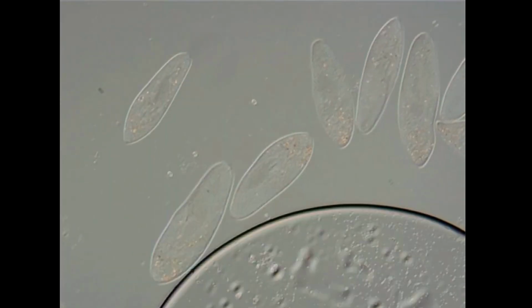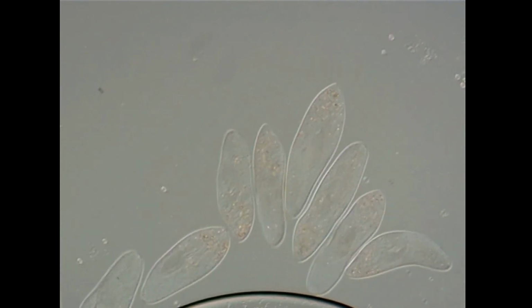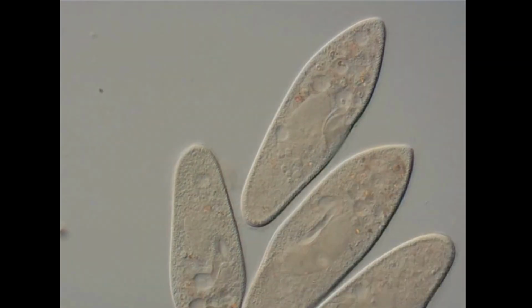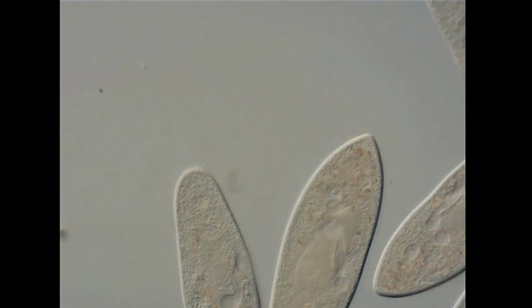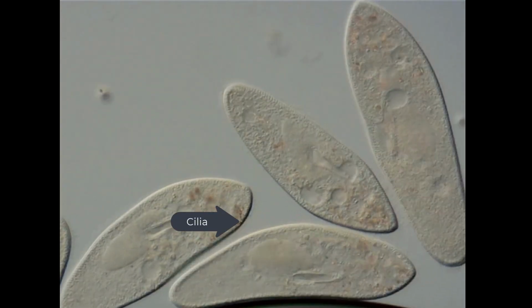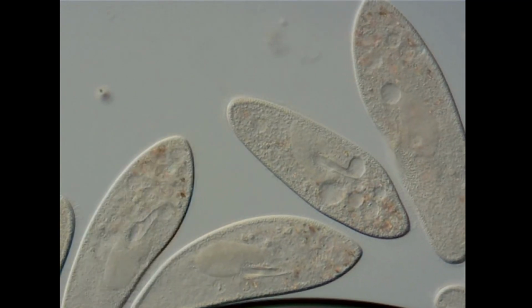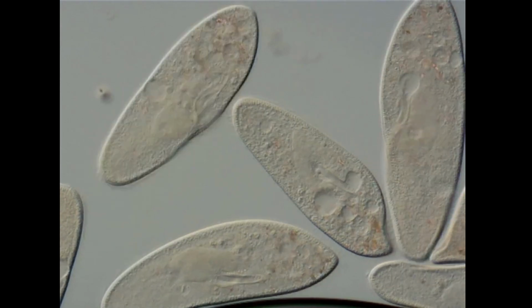Alright, and here's one more organism, probably my favorite of all. They're called paramecium, and they're single-celled organisms, and you'll definitely find them in your hay infusion, if not in your pond water. And you can see lots of different structures with this. They're covered with cilia all over their body, and you can see that's how they move and that's how they navigate. And they're really fascinating, cute little critters you can do experiments with. They're light sensitive, temperature sensitive, and so on.